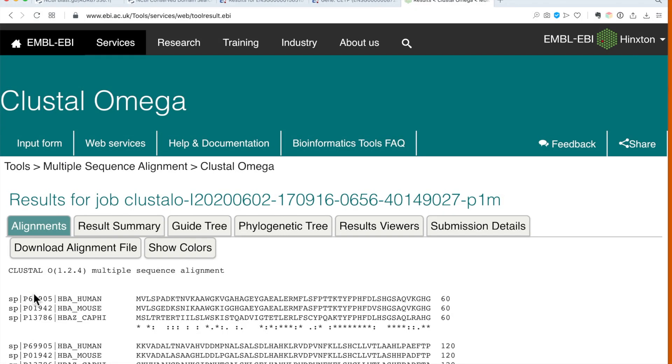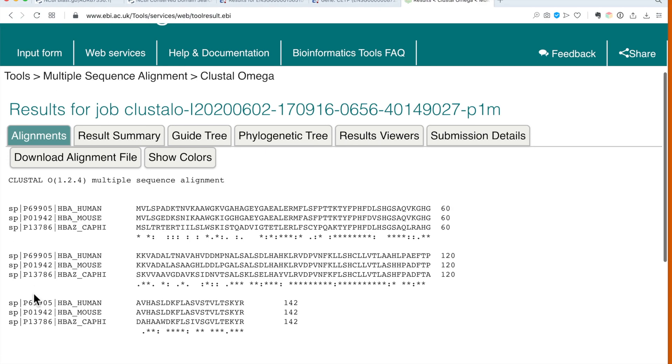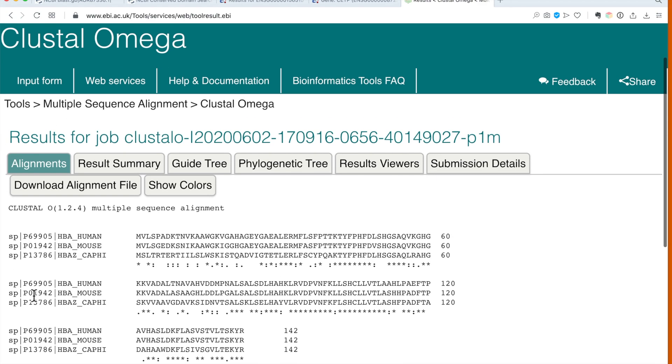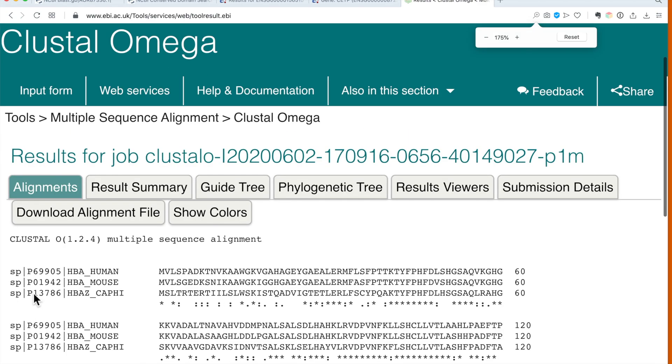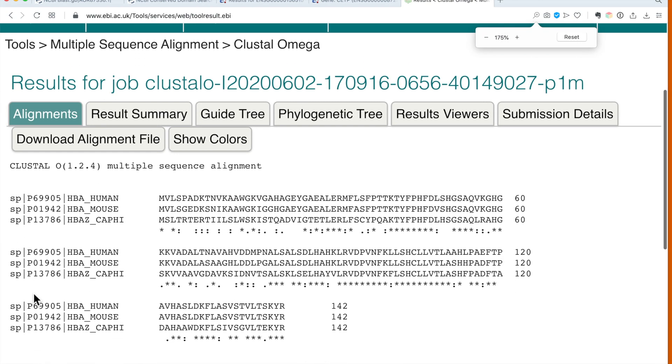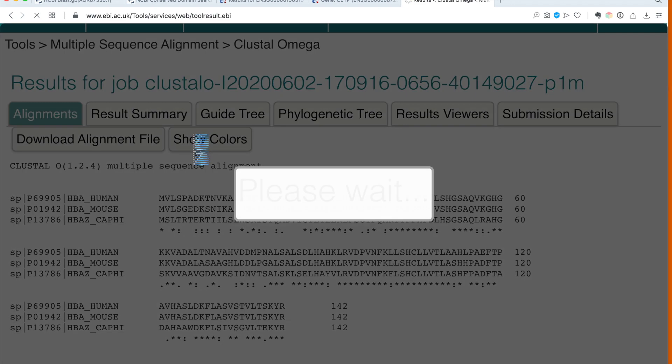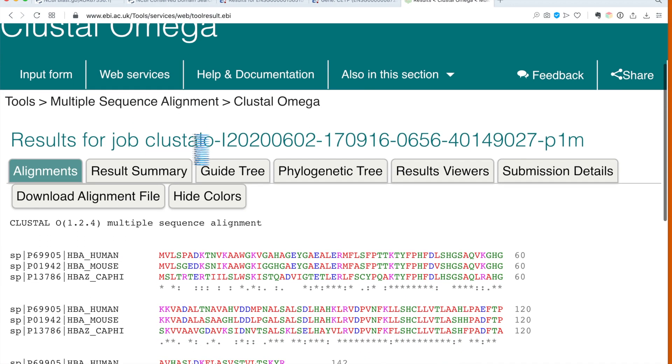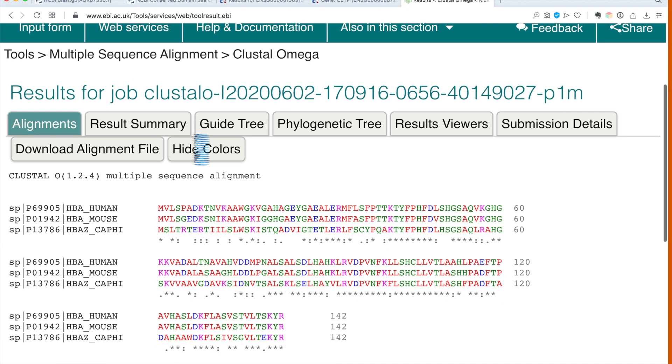Once the results are there, I have already made it slightly bigger so we can see the results better. Clicking on show colors will make the display a little bit nicer. We can see the three sequences on top of each other, and we have marked with a star where there is identity in all three.